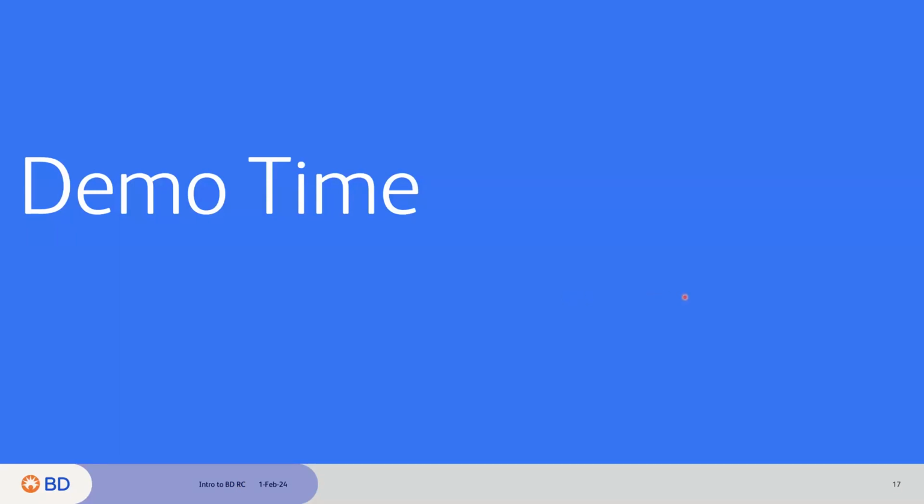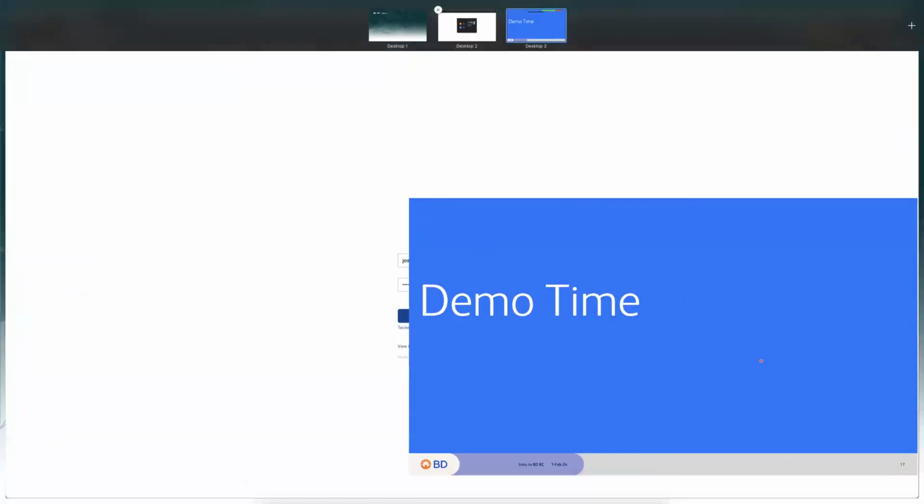Okay, let's jump into the live demo part. Does anyone have any questions at this point?